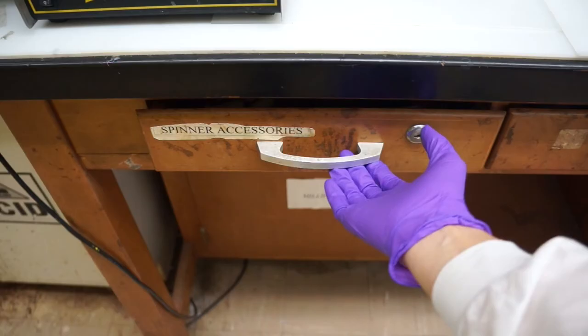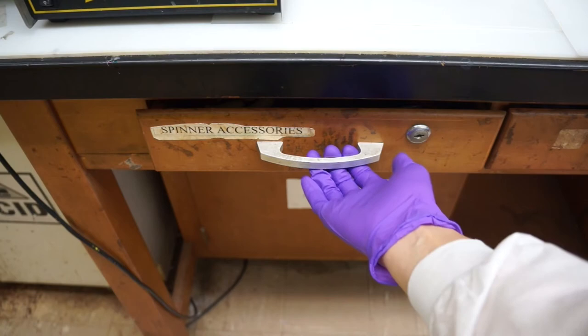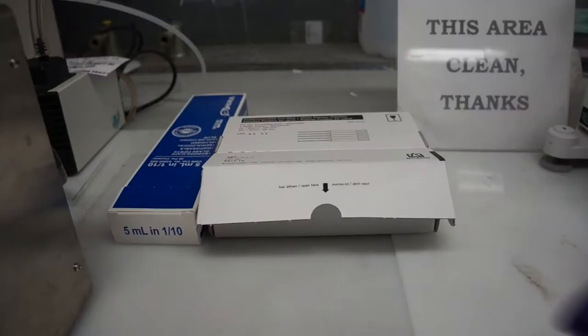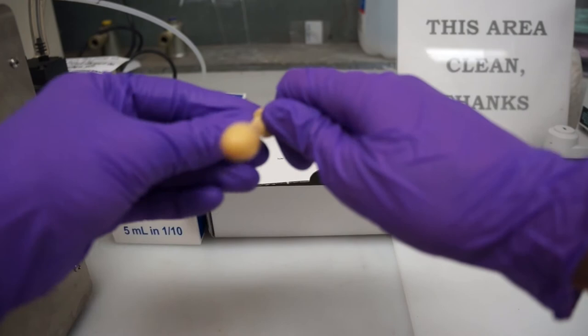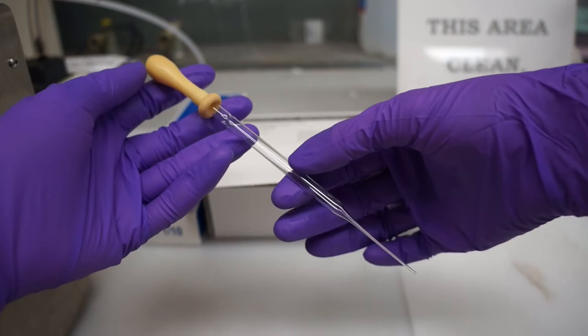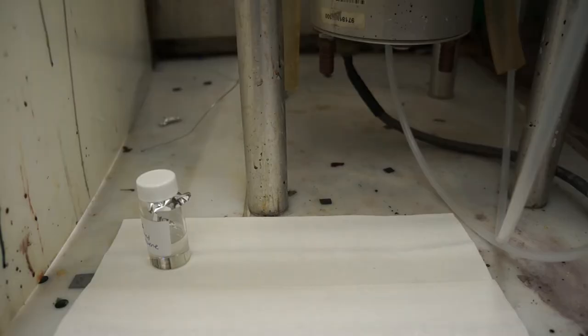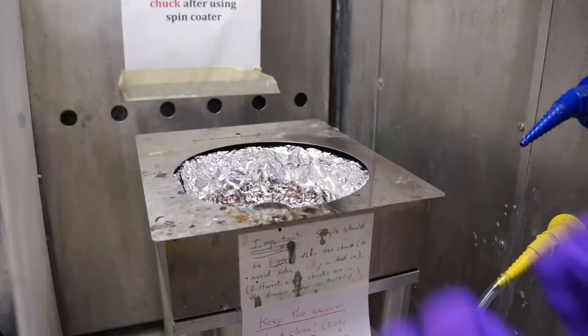From the same drawer as where we found the bulb we used for toluene, grab a small bulb. Also, grab a small glass pipette without any graduation marks on it and fasten the small bulb onto it. Take the pipette, along with some paper towels and your filtered PMMA solution, right to the foot of the spin caster, so that they are ready when we need them.